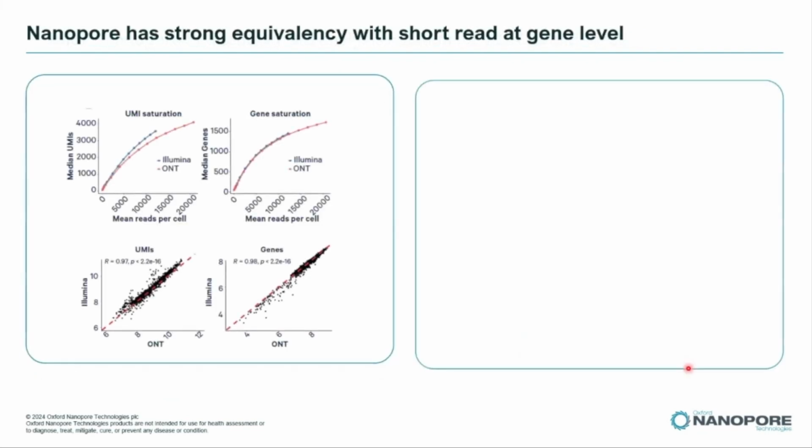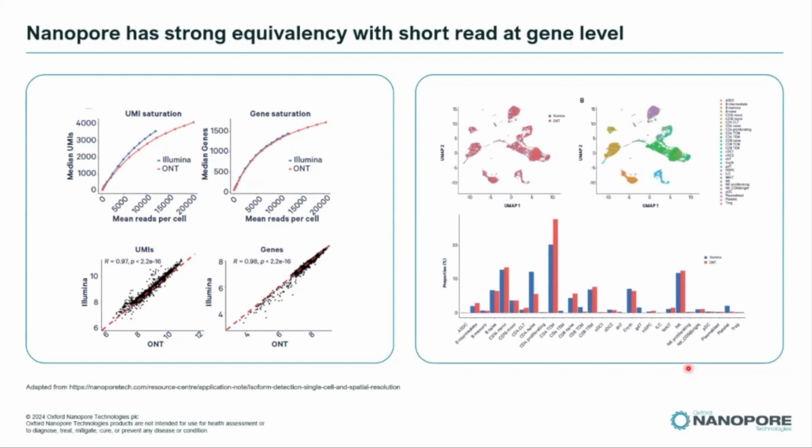In collaboration with 10x Genomics, we've provided a comparison of short reads and nanopore sequencing in order to determine if we got the same results from a given sample. And you see there the results of this experiment.